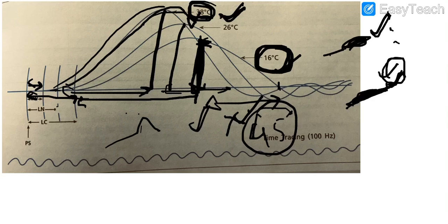And when we use the warm ringer solution or increase the temperature, it raises the temperature of the muscle, the contractile as well as the non-contractile. So obviously it will decrease the viscosity, that is one reason. Second is, if we increase the temperature within the optimal limit, over here 38 degree centigrade, then the activity of the enzyme will increase. If we increase more than 38, say if we are using 45 degree centigrade, then what will happen? We won't get the graph higher, it is the maximum at 38. If we increase the temperature more, then we won't get the effect.